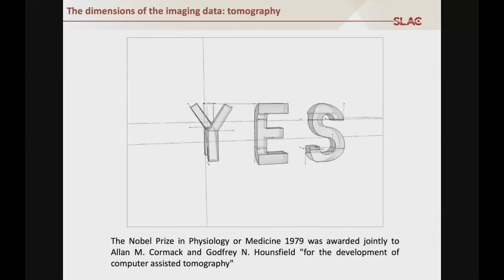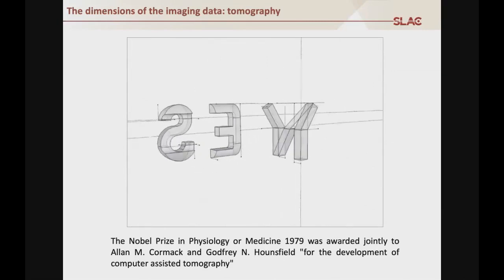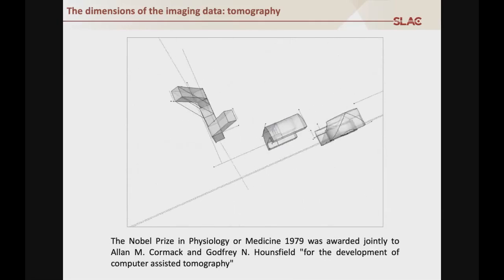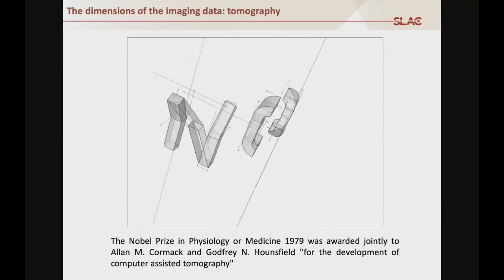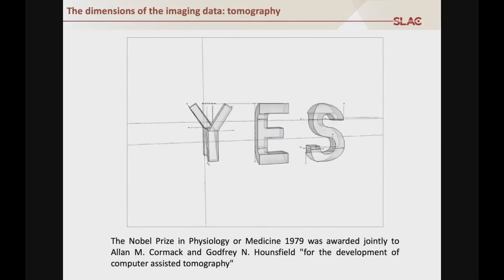It's my opinion that tomography is one of the most important developments in this field. I think without too much effort, I can convince you that knowing the three-dimensional structure of your sample is more informative compared to only looking at two-dimensional projection images.